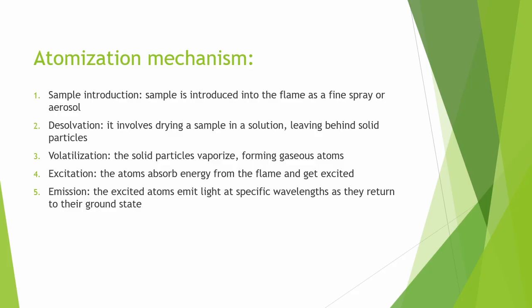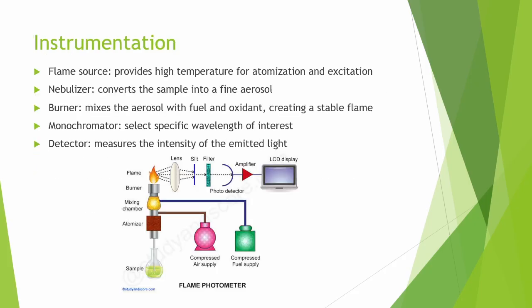And the fourth one is the excitation step, in which the atoms absorb energy from the flame and get excited. And the last step is the emission step. The excited atoms emit light at a specific wavelength as they return to their ground state.